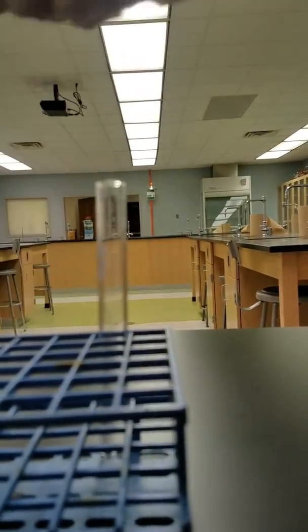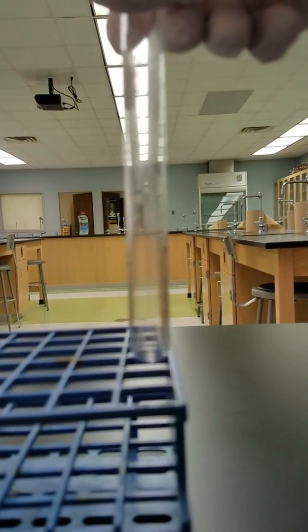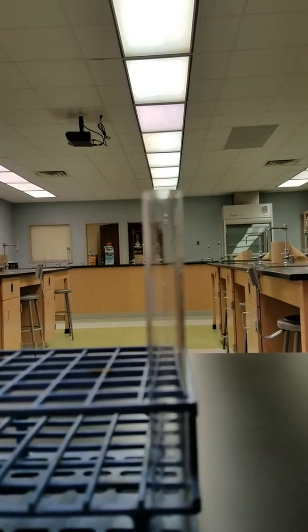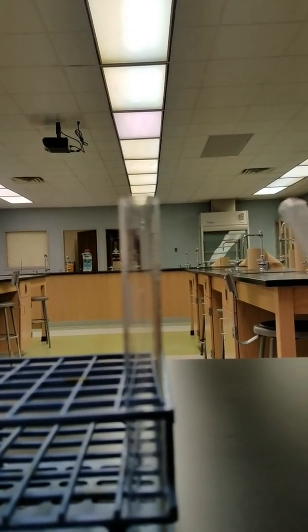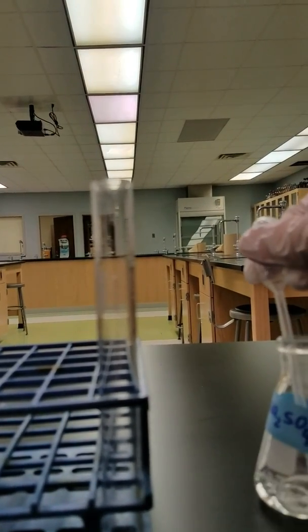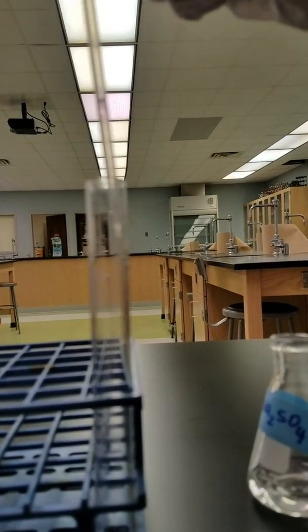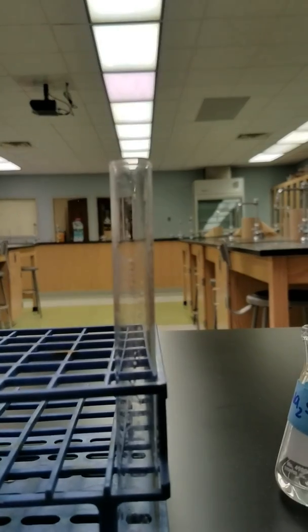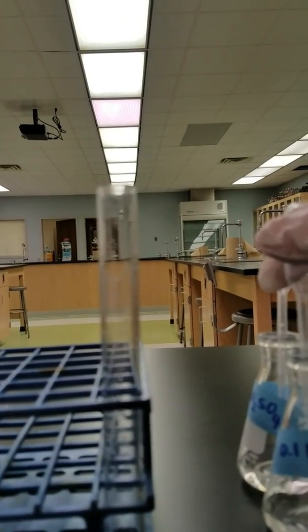So we'll move our reaction that we just did off to the side. And now we're going to mix two solutions. We have sodium sulfate and barium nitrate.